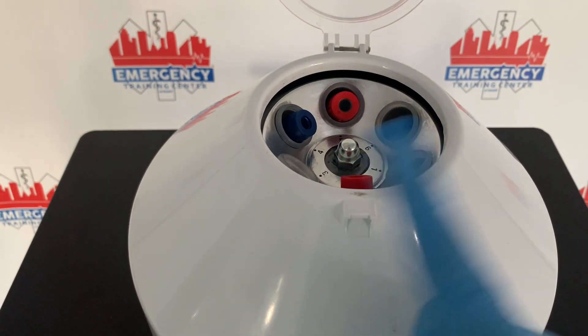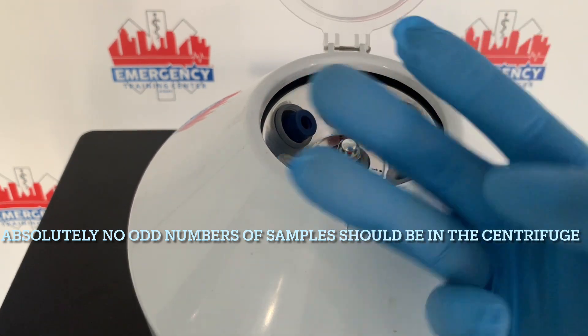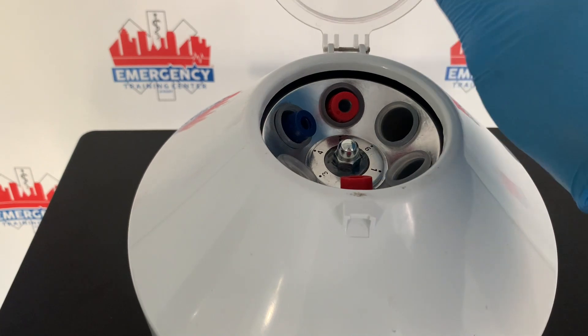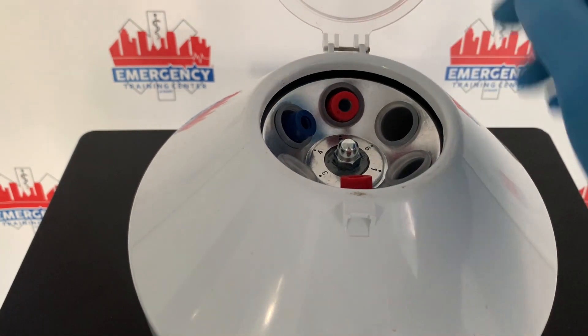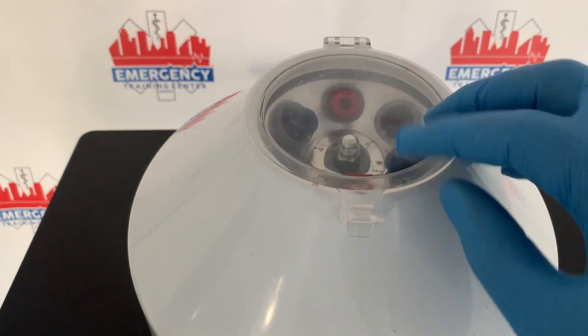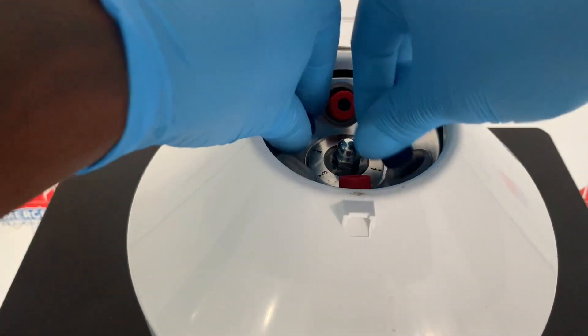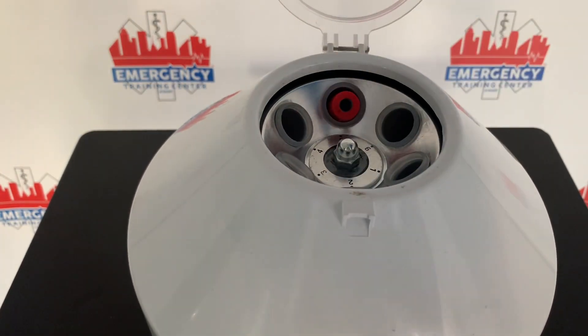You cannot have three specimens because that's considered an odd number — three is not allowed. If you have an odd number of specimens, it could cause the machine to shake and could cause the specimens to be ruined, so you don't want that to happen.